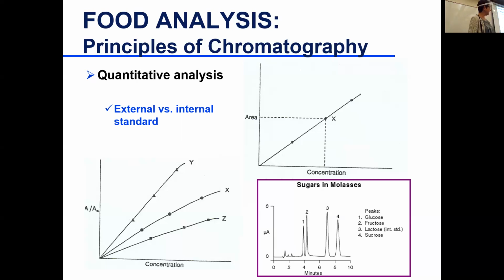So when you take these fatty acids and you run external standards, oleic acid, linolenic, linoleic, stearic, all of these fatty acids, you prepare external standards like you did, great, you can quantitate. But if you have losses during sample preparation, you're not able to account for these losses. If you use an internal standard, the internal standard corrects for losses during sample prep. So how does that work?